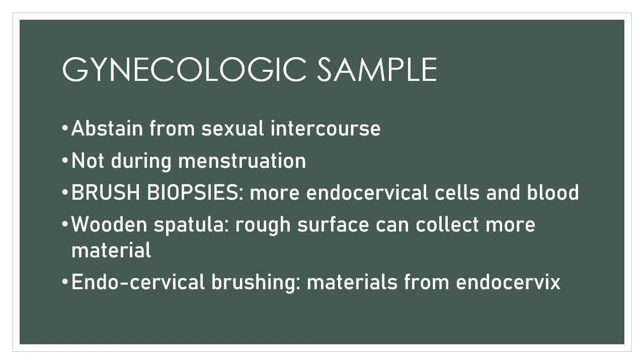Brush biopsies produce more endocervical cells, and blood may be present in the smears. Brush biopsies collect more endocervical cells and blood. The presence of blood in the smears will make evaluation difficult. And then you have your wooden spatula.